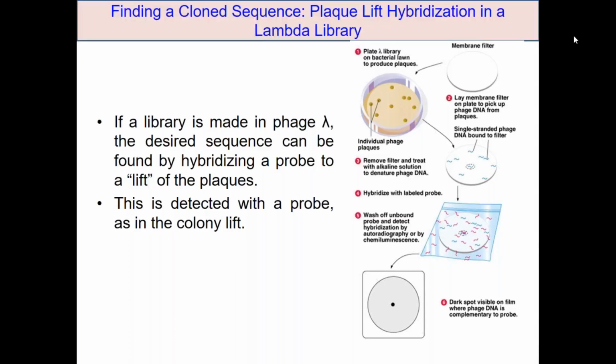So now what I am going to do, very carefully, I am going to take this membrane and keep it on the surface of this media. So now what will happen? Some of the bacteriophages will come and attach. And one more thing here is, after attachment, all the bacteriophages have single stranded DNA.